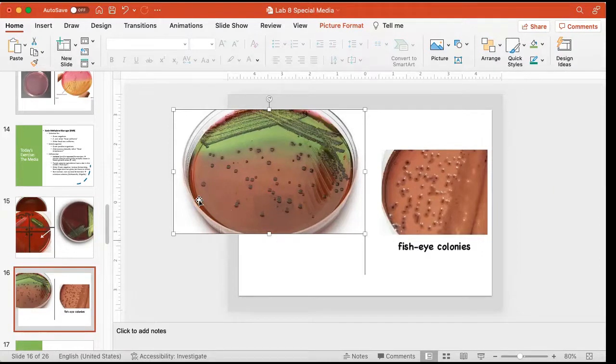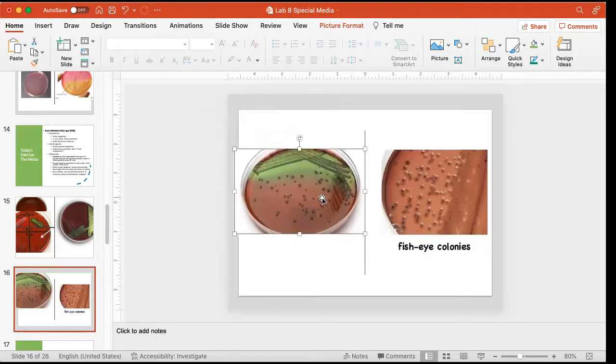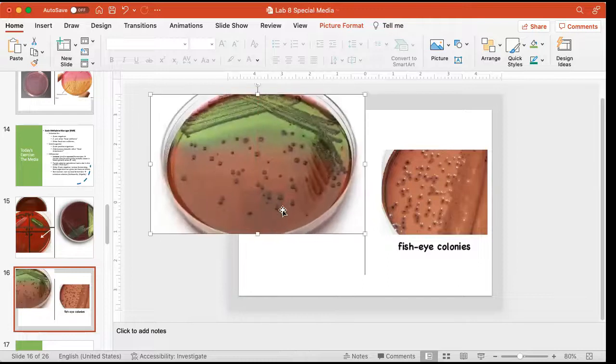And the purpose of the quadrant streak plate is to get isolated colonies. And they were successful with that. They got some colonies here. And you can see that these colonies are purple. Can you see it? They're purple. I know then that this is a gram-negative fecal organism that's also a coliform. It can ferment the lactose and/or the sucrose that's in the media.